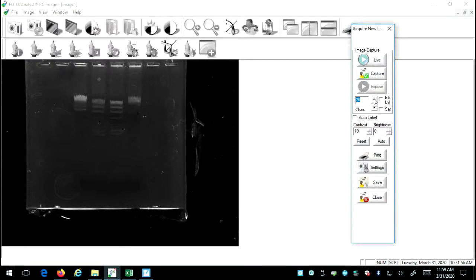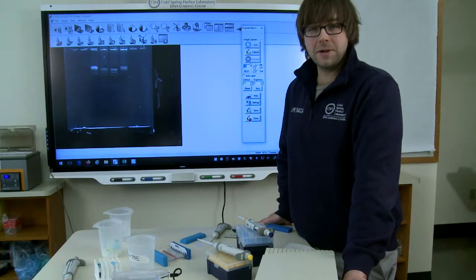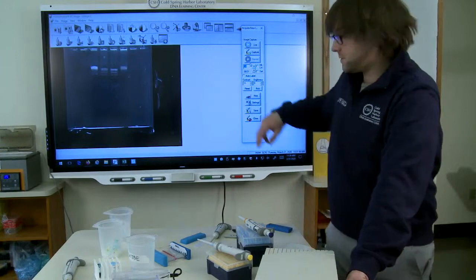So it's a little faint. And also, I loaded everything out of order. So I've got to be honest with you guys, right before this lab started, I started a gel, and the mystery enzyme didn't work. In about 10 minutes, I set up another gel. So I think I misloaded them, or I loaded them out of order. But whatever, we can still answer our question.